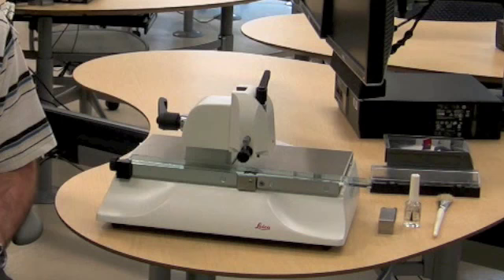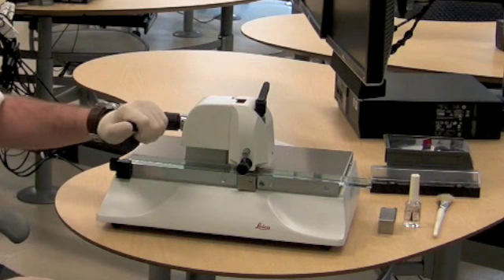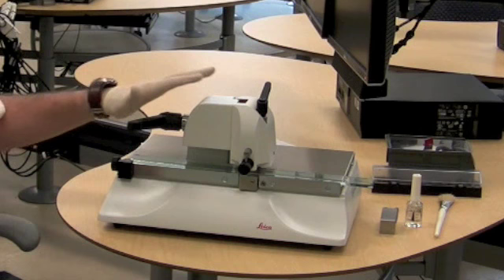What we're going to do is take our clamping lever and turn it so that it is horizontal to the desk and facing us. Once that is done, we're going to take the rotatable knob and turn it back to the back of the machine, and that's going to release it from the side of the glass. Now the glass is held in place by the clamping head.